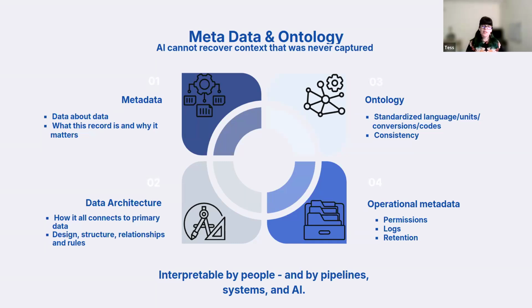And this is what is nice about an inventory, like what SciNote provides: you're able to sort of lock down some of the language that you're using. You can put in the column name, the units that you're using. You can ensure that on the metadata, if there's only four choices, then people can only choose between those four choices and not handwrite free form in any text that they have.